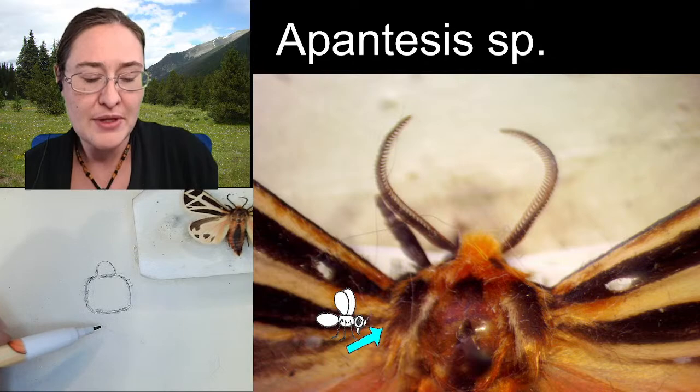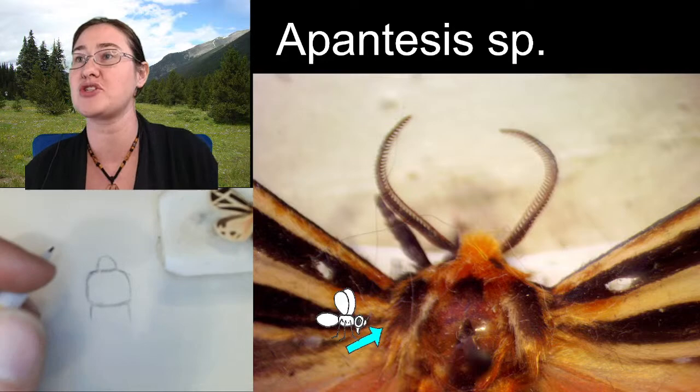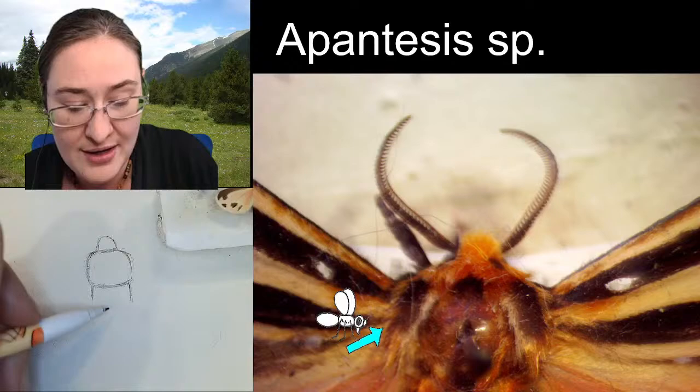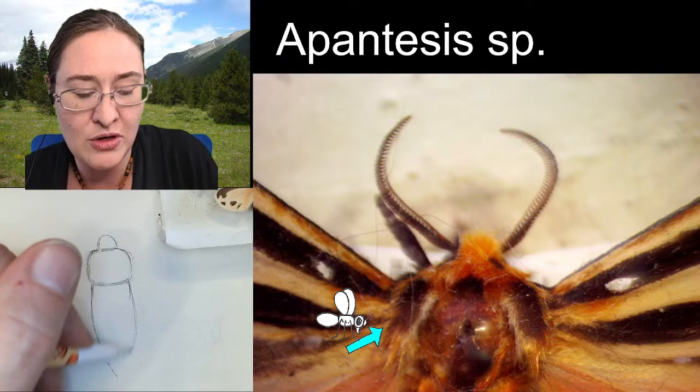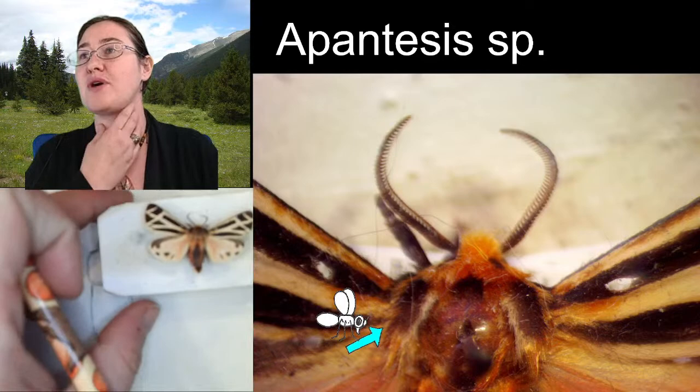Alright, so now we're going to add this abdomen here. The abdomen is nice and wide, way wider than the head, so you might just make sure that it comes out here. But it does start a little bit more narrow than the thorax, and I'm just going to give it an outline. When we zoom in, we're going to go ahead and count all of these segments and probably change some of the design in here. But that gives you a basis to work off of.